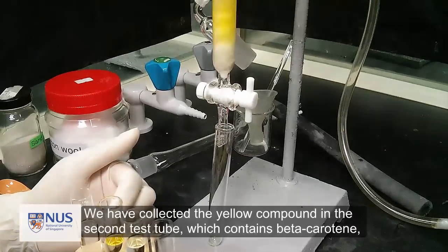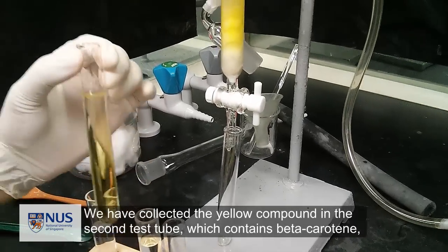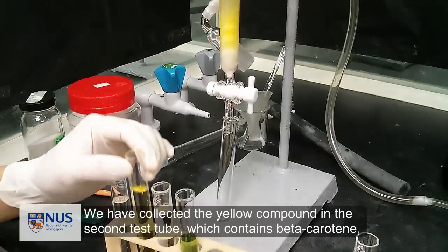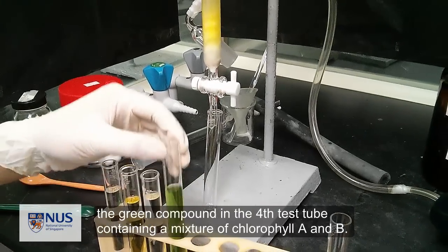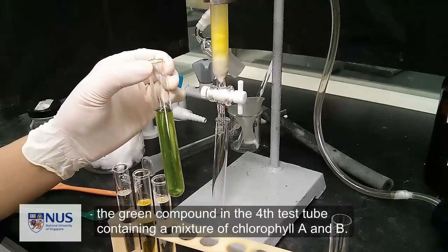We collected the yellow compound in the second test tube, which contains beta-carotene, and the green compound in the fifth test tube containing a mixture of chlorophyll A and B.